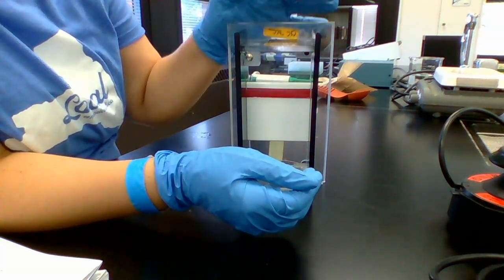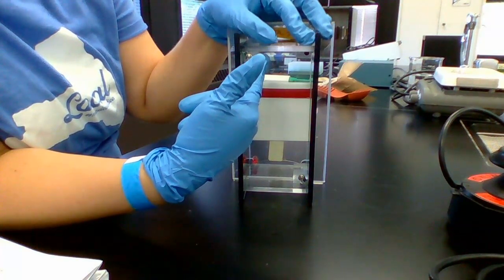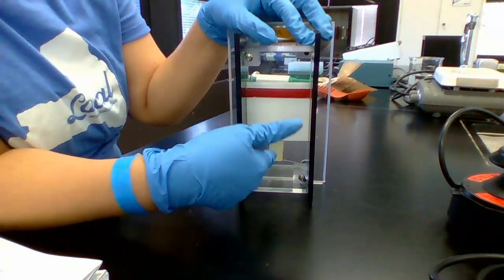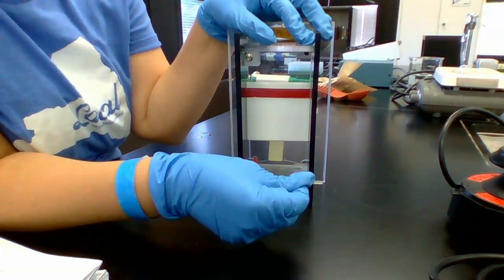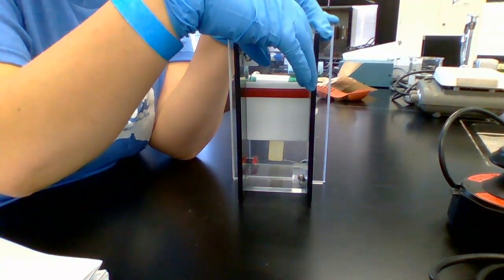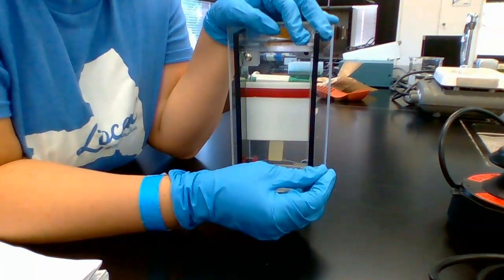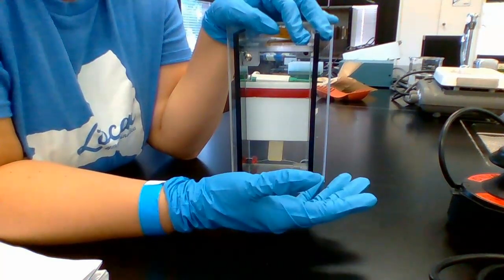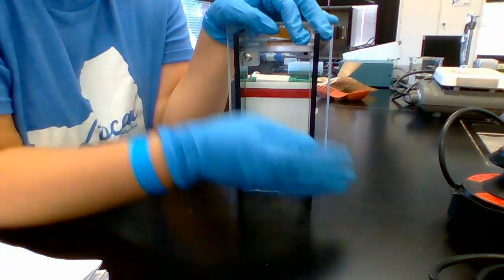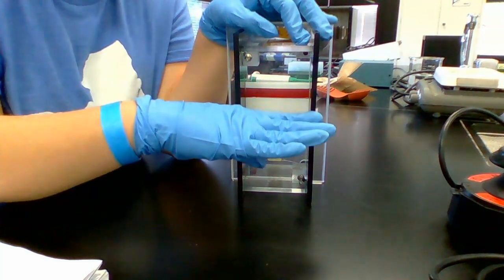Current is going to be applied, running from the negative electrode towards the positive. My negative electrode is up here and my positive electrode is down here. Current will come in from my power source running in this direction from negative to positive. Think about the charge on DNA — because of those phosphate groups, DNA has an overall negative charge, so naturally DNA is going to run towards the positive electrode. It's going to be pushed and pulled in that direction.